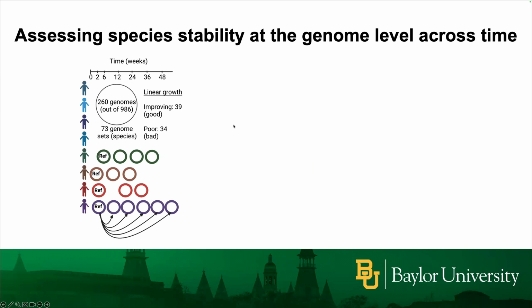So the other final thing we did was look at genome stability. Because we had a time series of these participants, we could ask the question, how do the genomes of a given species change over time? So in this case, we would look at the earliest time point, and then we would look at instances where that genome or that species was found in at least 2 additional time points. So it had to be found in at least 3 time points. And then we could compare the genome similarity of these latter time points to the initial time point.